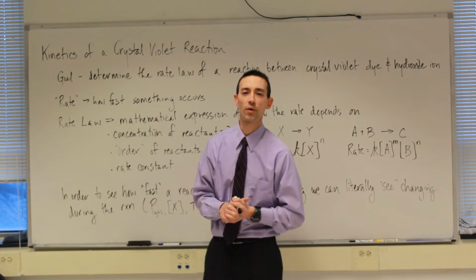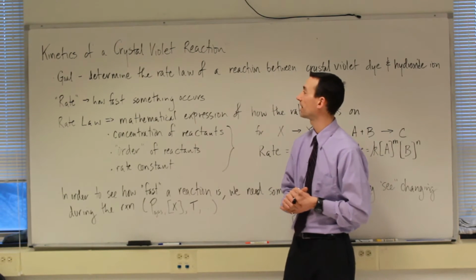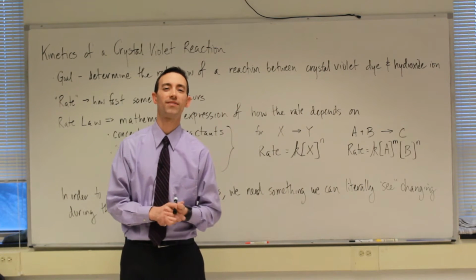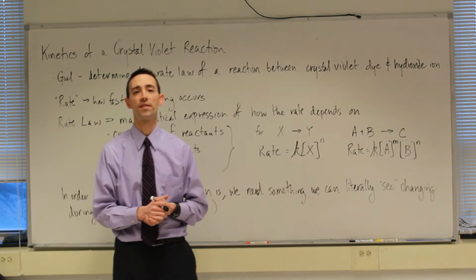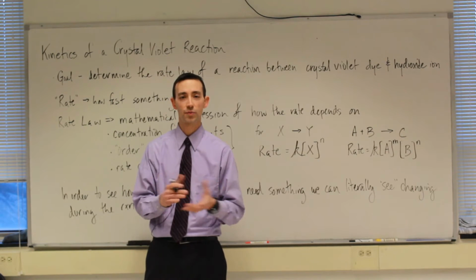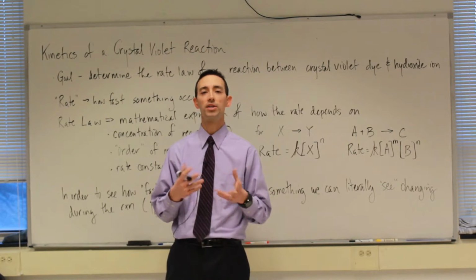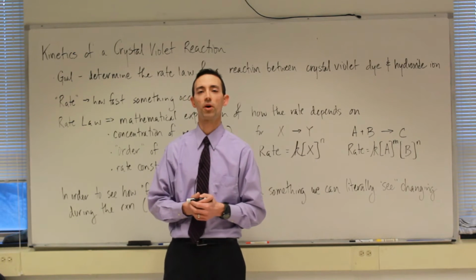This week in the General Chemistry 2 curriculum, we're getting ready for the kinetics of a crystal violet reaction experiment. Now, depending on where you're at in lecture and which day of the week you have lab, you may or may not have yet discussed some of the theoretical concepts that underlie this week's experiment. So I'm prepared to give you a little more background information than usual this week, just to make sure you're ready and understand what you're going to be doing as part of the lab.